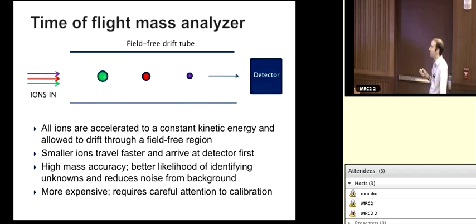The number of times when this actually happens in the context of metabolomics is relatively small, however. So generally, the mass accuracy, in other words, the ability to measure the number of decimal places, is not all that much different here. It's just that you can do a little bit more fine resolution.